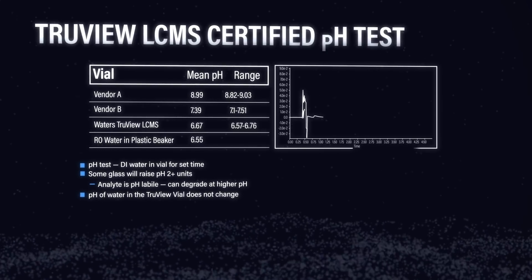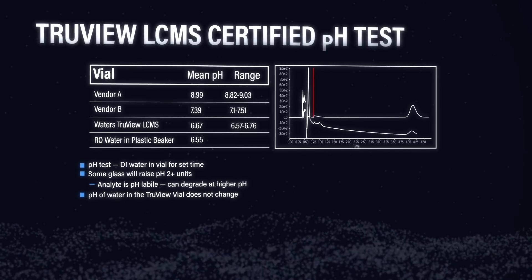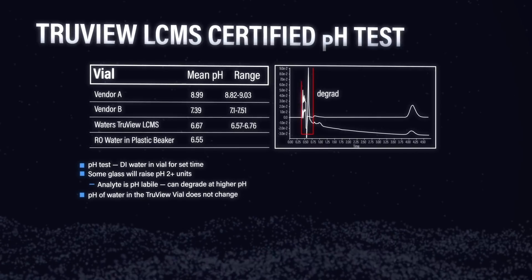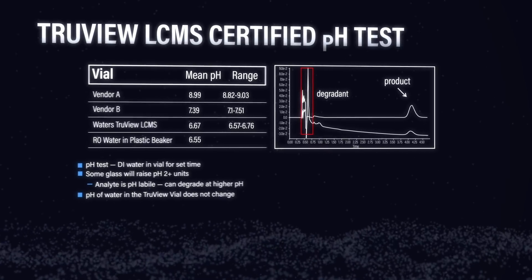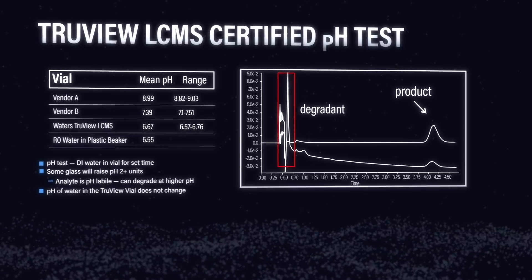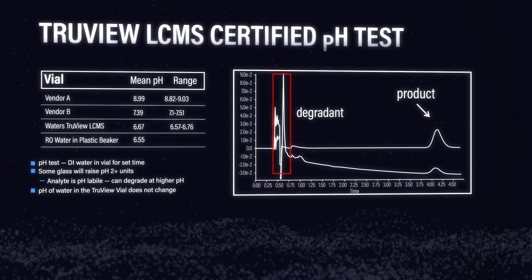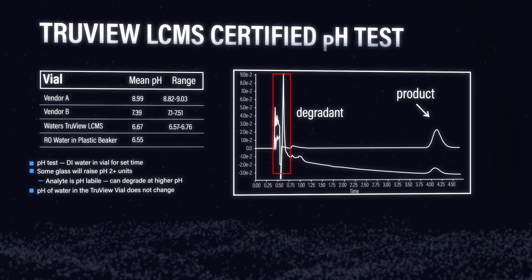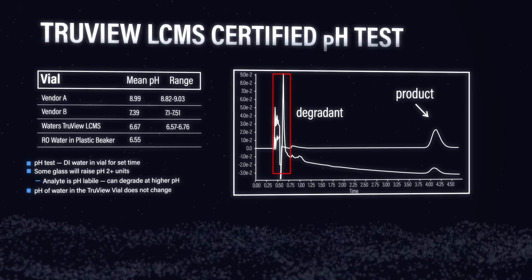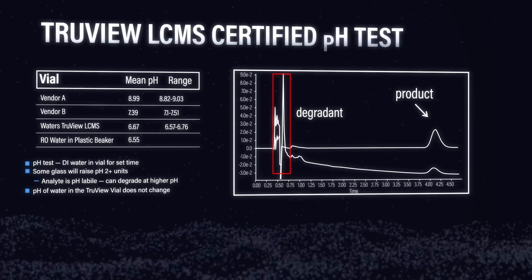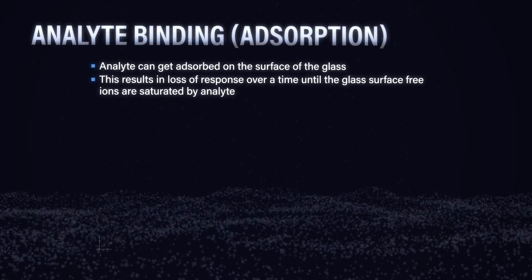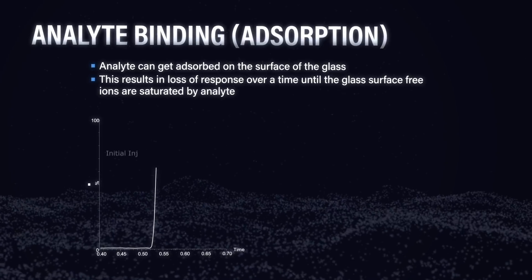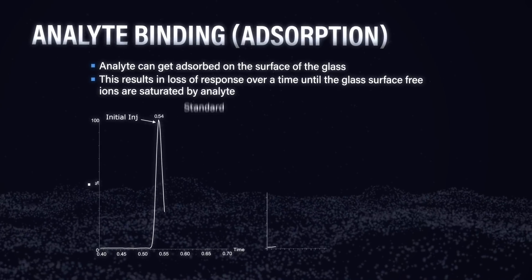But when you look at the data, you can see that some of these vials significantly increase the pH of the water. In doing so, if you have analytes that are sensitive or degrade under more alkaline pH conditions, you're going to cause some problems — the sample is going to degrade.